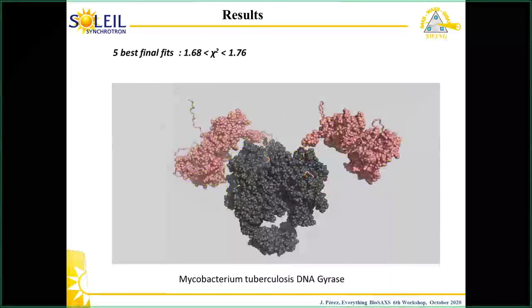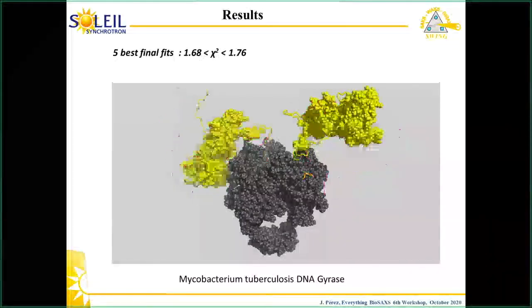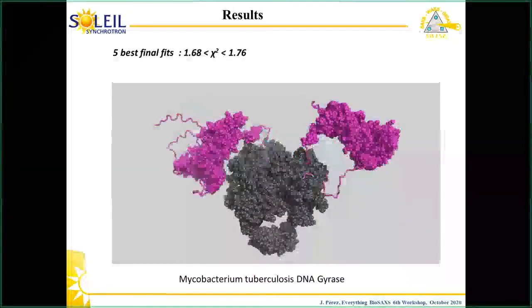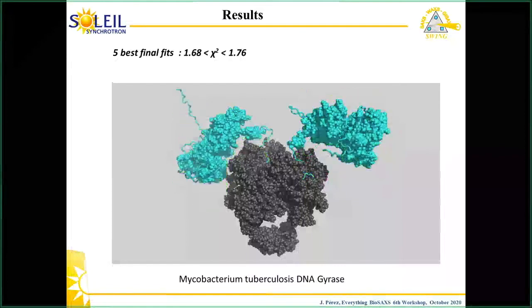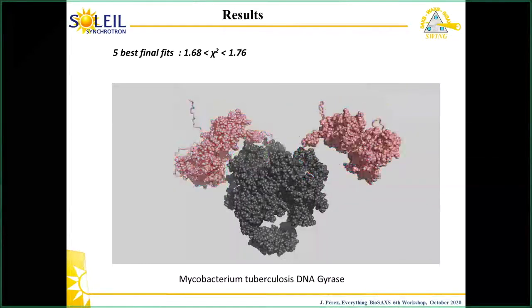First, each of the models we are showing is just a representation of an average of the conformations. It shouldn't be thought of as a rigid structure. Nobody will believe it, of course. And not only this, but as you can see, even different averages can be obtained, which will fit the data equally well. And so what can we say then from this output?